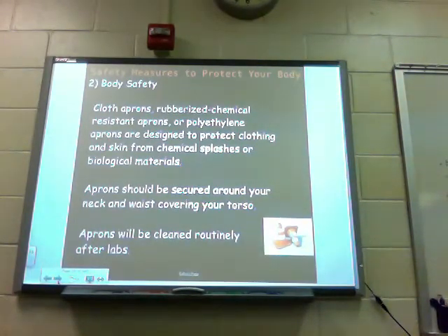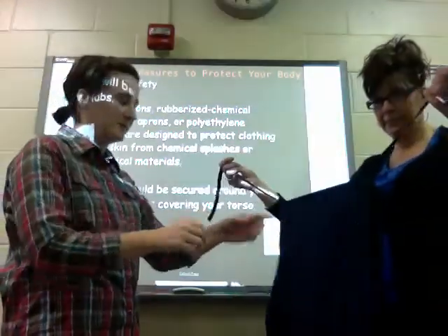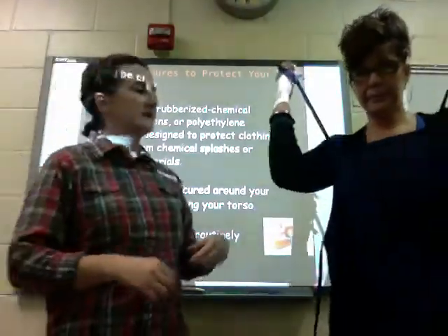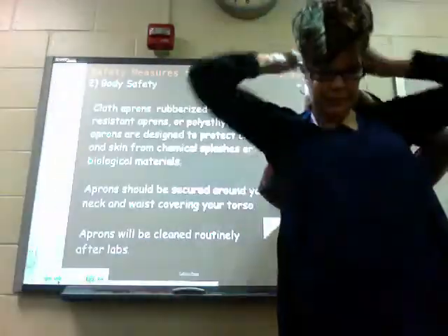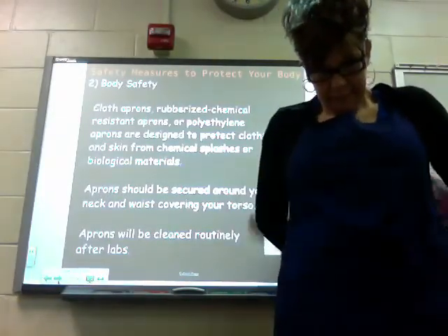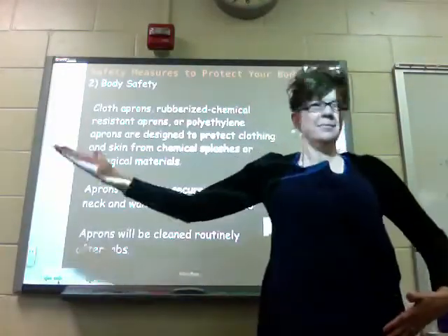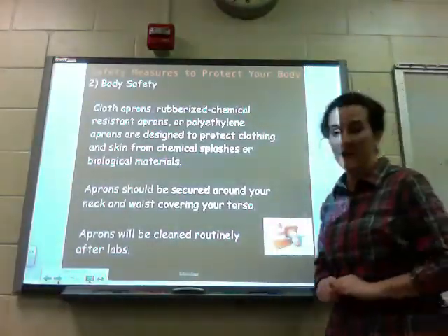Body safety, step number two. Cloth aprons, rubberized chemical resistant aprons, or polyethylene aprons are designed to protect your clothing and skin from chemical splashes or biological materials. We have two different models — plastic and cloth — and cloth is what we'll be using more often in class. Ms. Gold ties it around her neck; sometimes you may need a partner to help you, and that's okay. Aprons should be secured around your neck and waist covering your torso. Aprons will be cleaned routinely after labs.